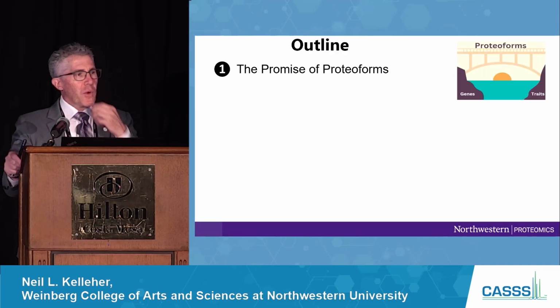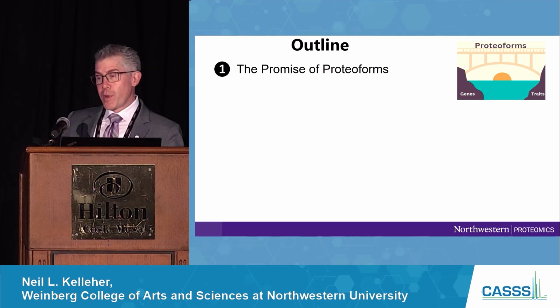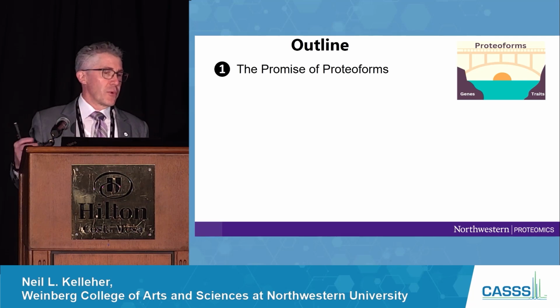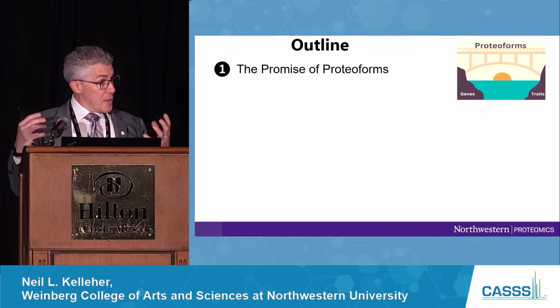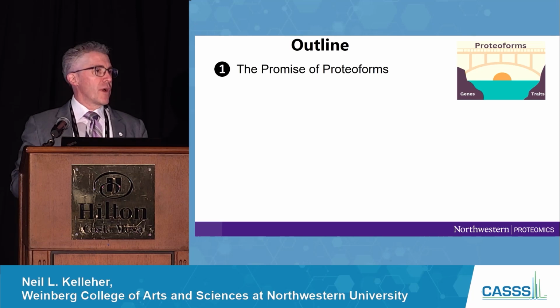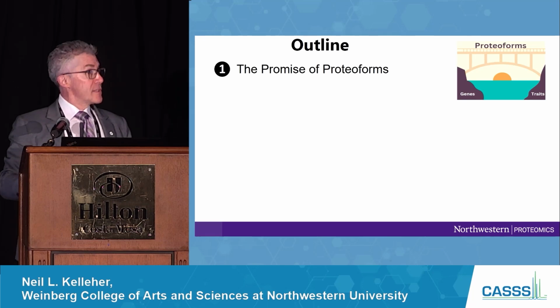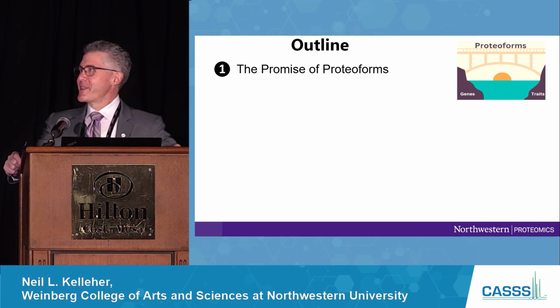So the proteoform promise is something I've been pitching for a lot of years. It is growing, that's good. And some of you who know me in an academic context and aligned with government resources, I'm pitching a human proteoform project, an arc and cadence of which would be like the Genome Project. So like we sequenced all the DNA in our bodies, can we domesticate, regularize, and sequence the proteome? I'm not going to talk about that today, but I welcome questions about it.